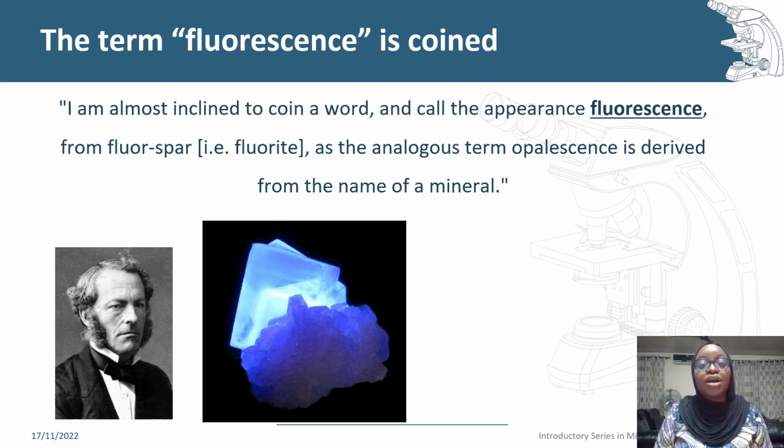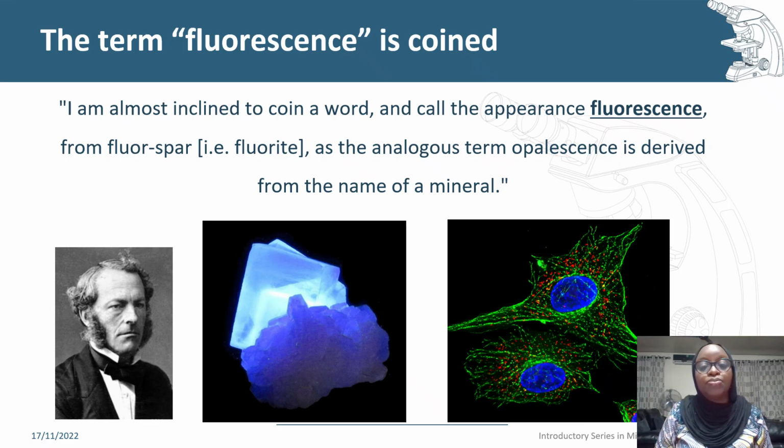Fluorescence is also associated with minerals, that is, fluorspar. Over the next 200 years, enormous growth in this discipline was seen, and fluorescence is a very important aspect of microscopy today, especially as regards biological samples.